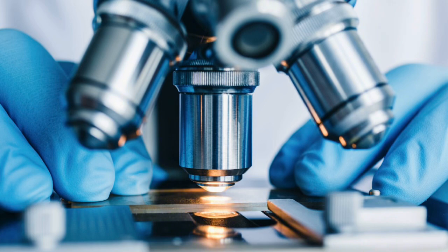One of the most iconic tools in forensic science is the comparison microscope. This microscope connects two microscopes with a split view, allowing examiners to look at two samples side by side simultaneously. It is most famously used in firearms and tool mark analysis. By comparing striations on bullets or cartridge casings, forensic scientists can determine whether two items share a common source.